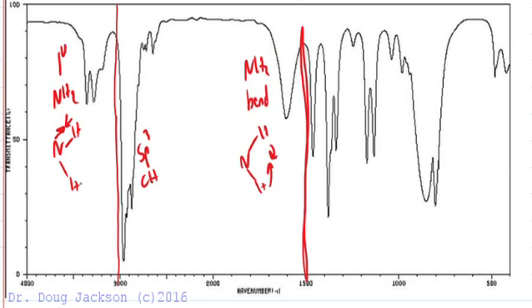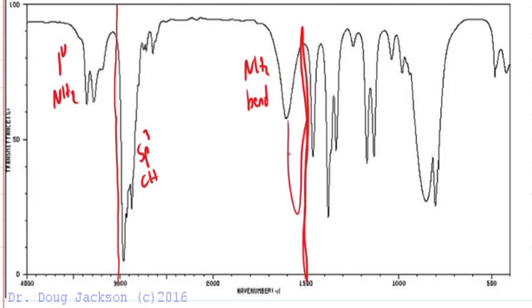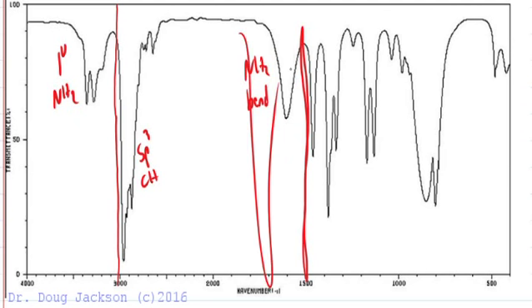Okay, so a bend versus a stretch, and whenever we see NH2 stretch, for a primary amine we expect to see that NH2 bend. That applies to amides as well. Amides would also have evidence of a CO double bond in that same region, maybe even a little bit over to this side actually for amides. Okay, but to the left of 1500, this is definitely an amine.